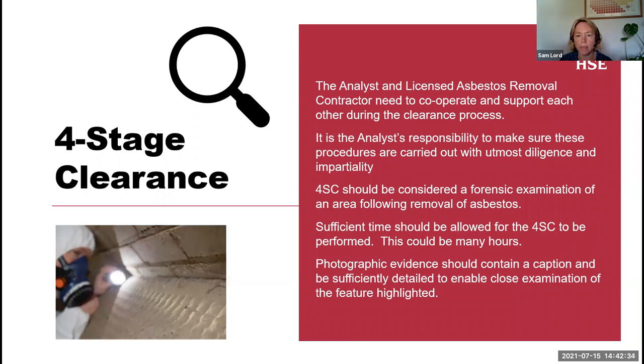We've talked about this, and also the photographic evidence, which should be captioned and be an appropriate photograph. I don't know if anyone watches those forensic examination programmes, CSI, I think it's on BBC Two this week, but they're very much getting good photographs and highlighting what they mean. So don't just take a photograph that's showing nothing really. It really needs to be of good evidential quality.